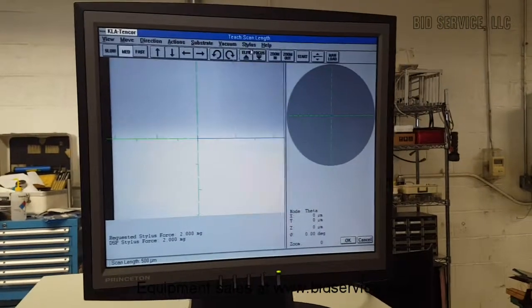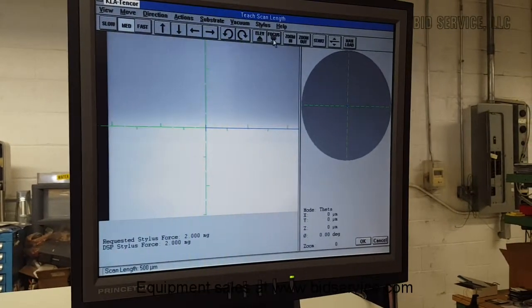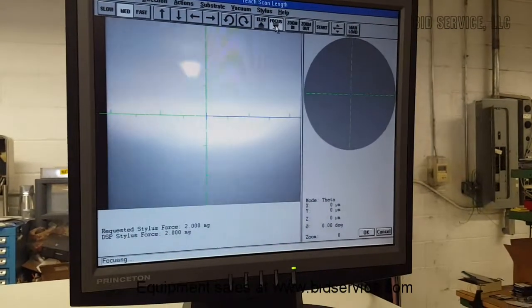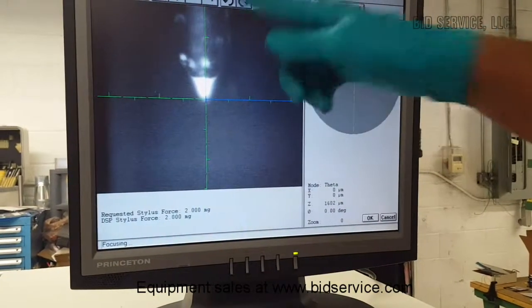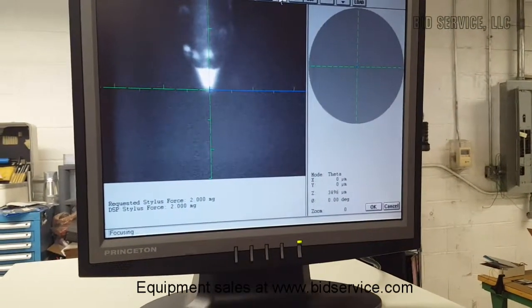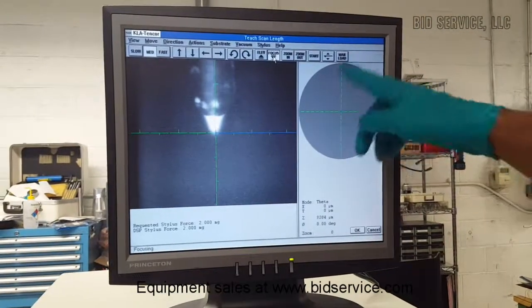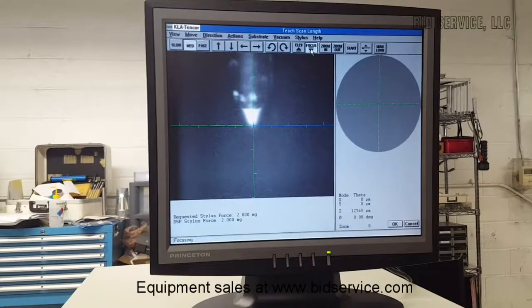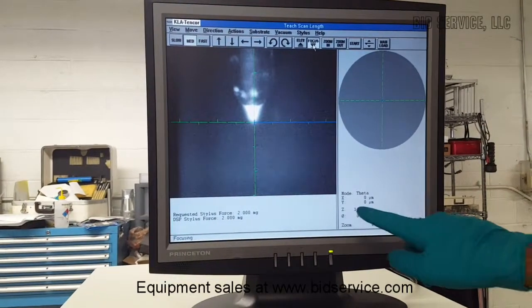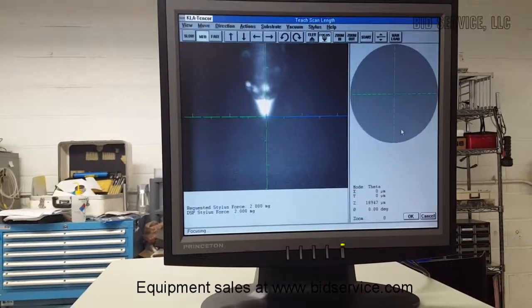So once the screen appears, at this moment we know the tower is all the way up. I have already placed a sample, and I'm going to focus the sample here. We can see the stylus tip from the front view mirror assembly, and this one represents the wafer, and it's currently going to the X0 and Y0 coordinates, and you can see the Z-axis values changing.